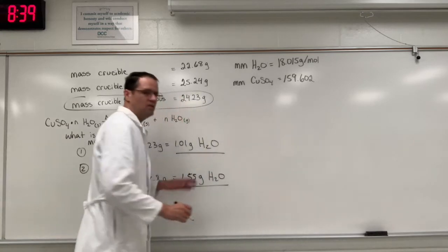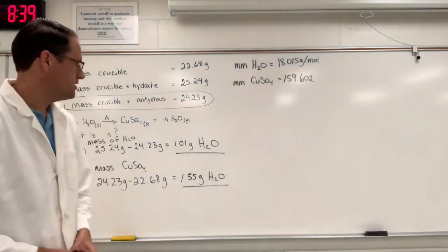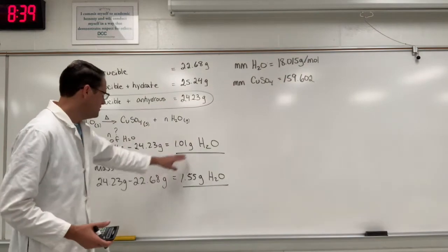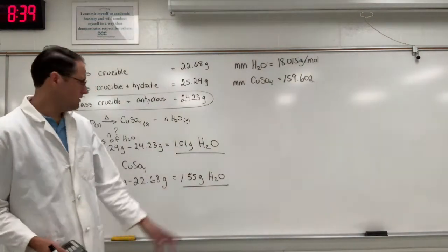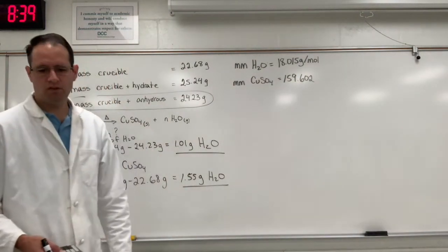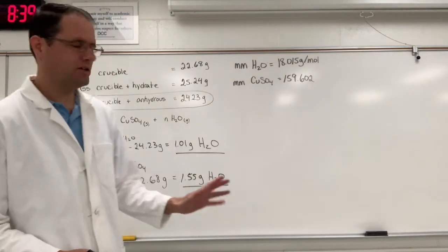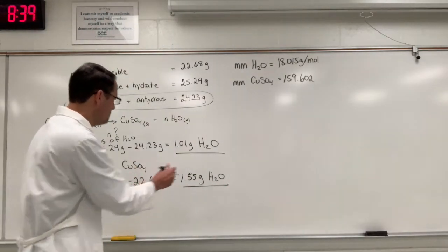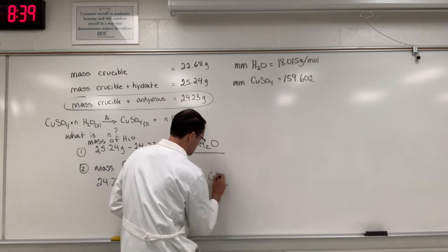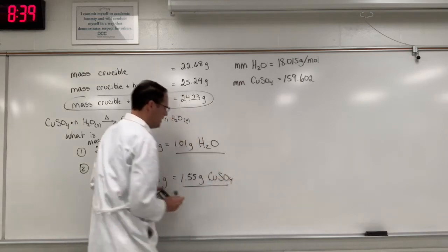Now I'm just using a top loading balance here for this demonstration. So everything's accurate out to the hundredths place. So you want to maintain the hundredths place for all of your significant figures or your digits here. That's copper sulfate.